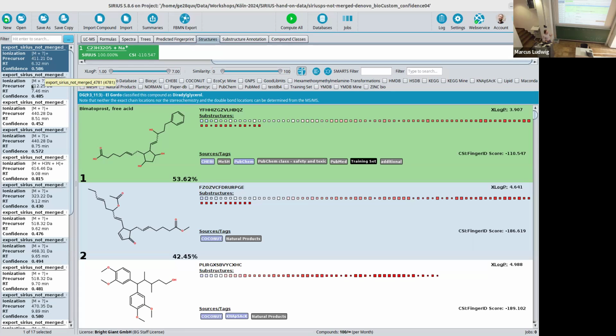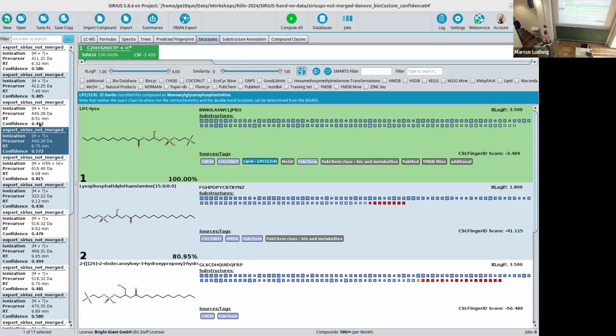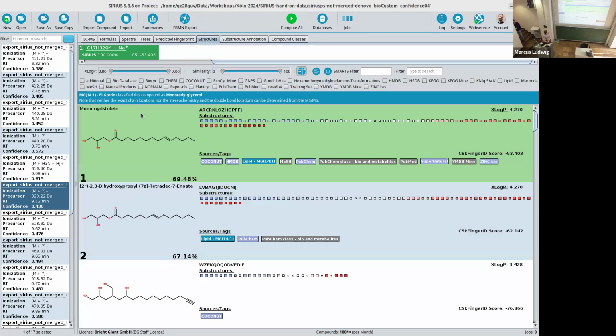So that's the thing. It's usually not that we do completely wrong, because taking the lipid example here, it was predicted to be a phosphocholine, and also in the structure database, it's a phosphocholine, so we also take it that this may be something like that. But maybe it's not exactly this one, especially if we have this double bond thing in there. Really we cannot differentiate.